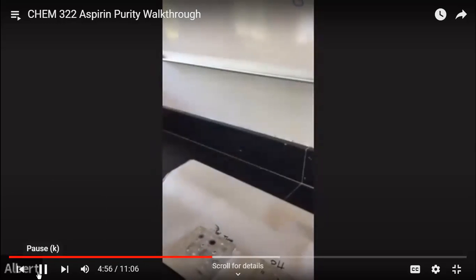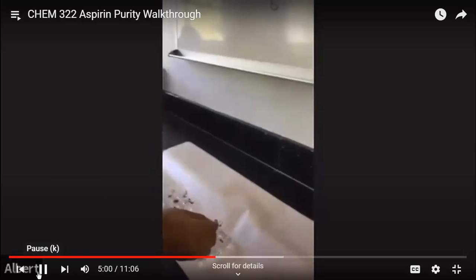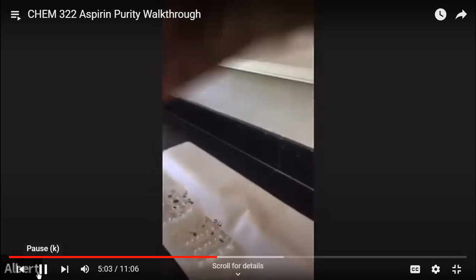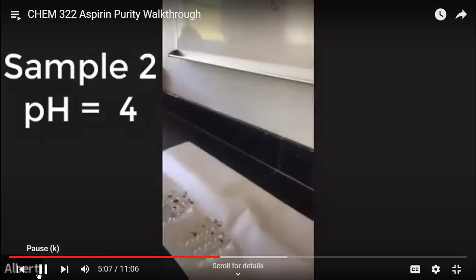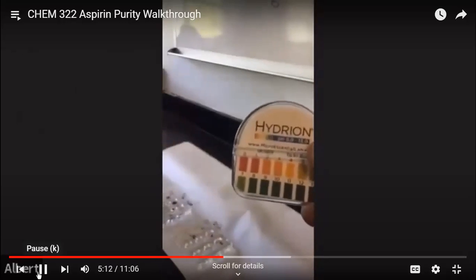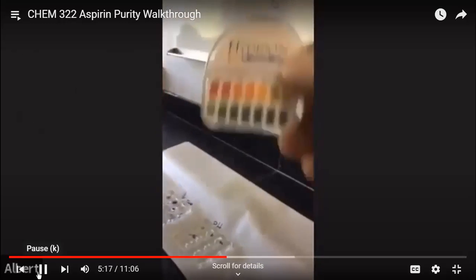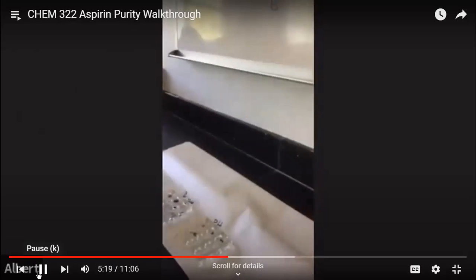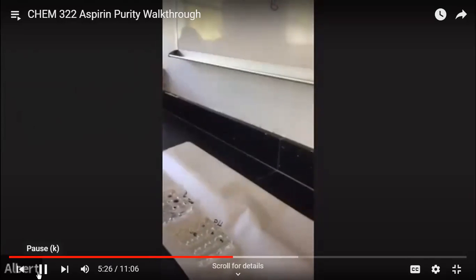So go ahead, group. About the same, about 3 or 4. Same for that one. And again, this is the guide right here, so we can match it up. Yeah, about the same. So we're looking at each one of the samples having a pH ranging from 3 to 4. So it doesn't matter which one you pick: 30, 11, 106, they all have a pH of about 3 to 4.